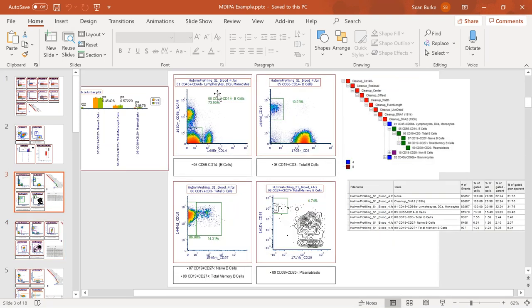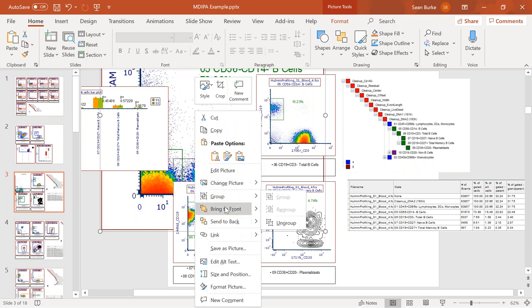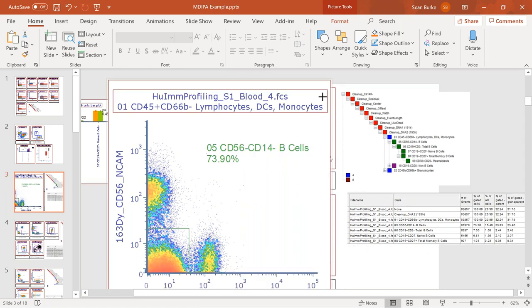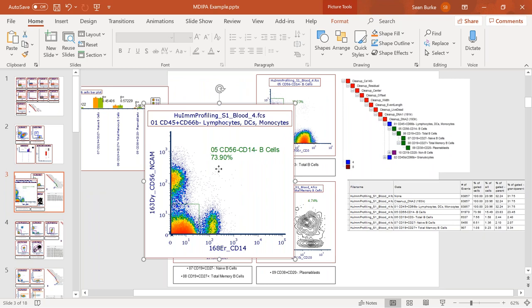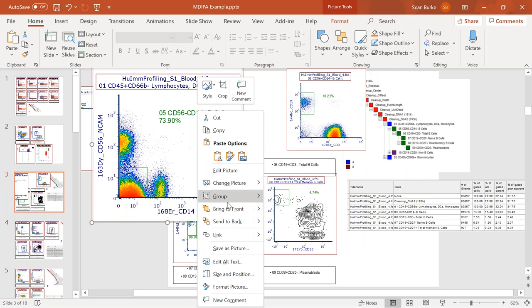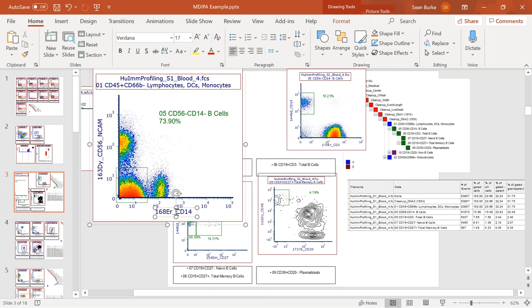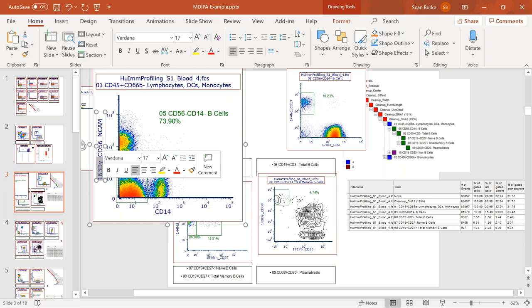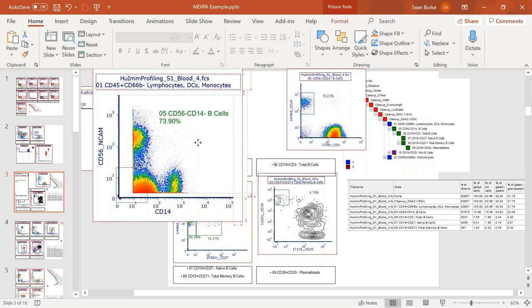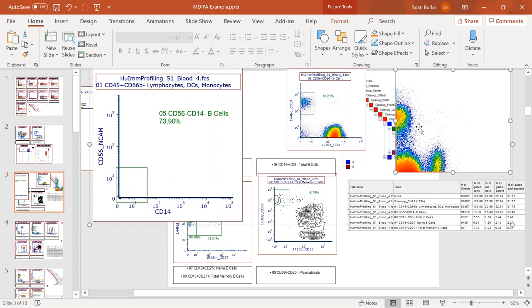You can see all the information has been exported to PowerPoint. If you need your B cells chart for a lab presentation, you have it — it's super high resolution and already in PowerPoint, ready to present or bring to publication. A unique trick: the exports are not one big PowerPoint object but individual objects you can group and ungroup. So if you didn't like '168ER' on the axis and just wanted 'CD14,' you can make that change directly in PowerPoint without fighting with Illustrator or Photoshop.